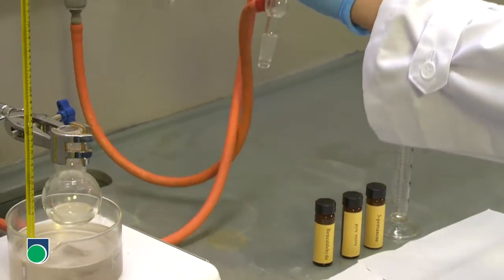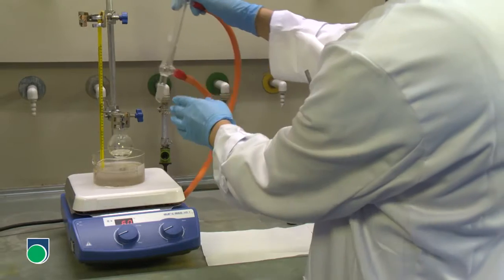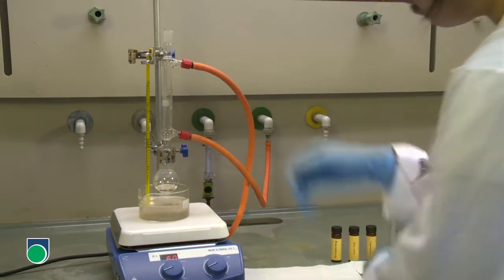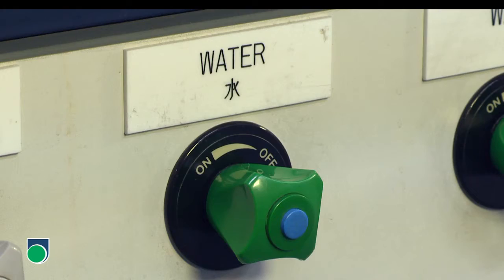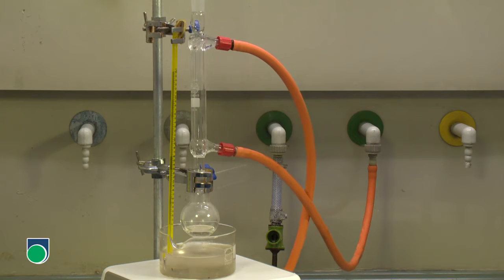Fit the flask with a water condenser. Check carefully for any leakage from the screw caps. Turn on the water tap carefully. Make sure that the water flow is in the right direction.